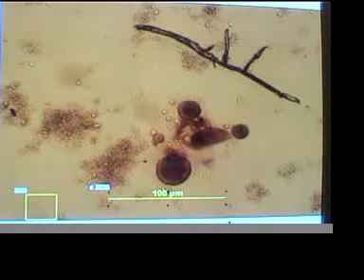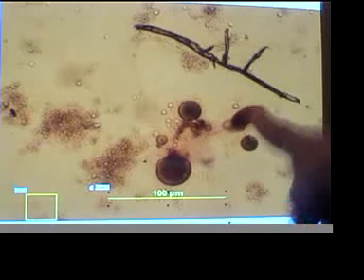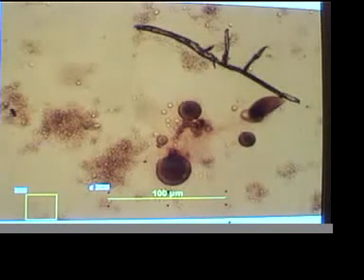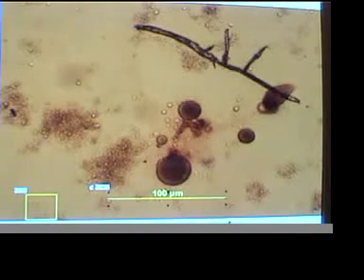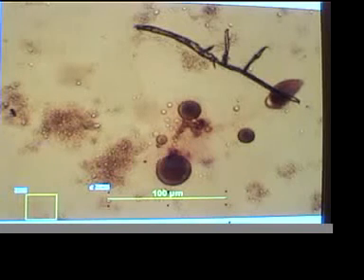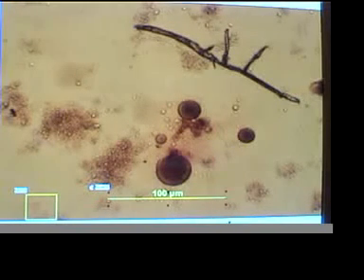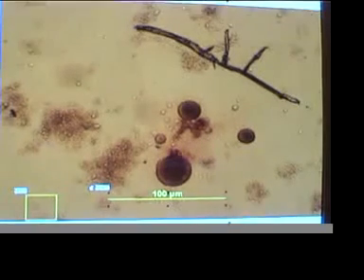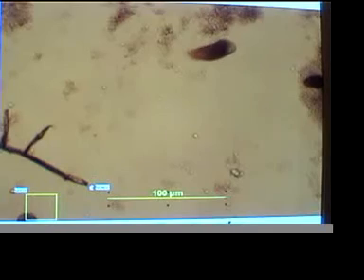and yet not far from him, and look, this little piece of him is trying to swim away. That's amazing survival strength, isn't it? And yet not far away we see many who were not affected in that same manner. I see another one who's growing a bubble. Let's see, there he is.